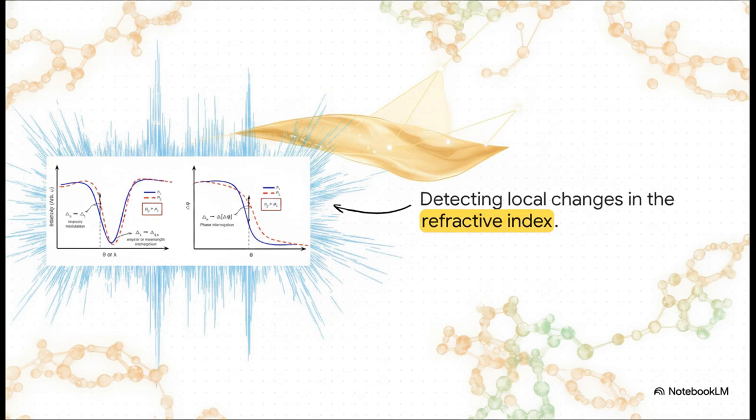So, the crucial point to take away from all of this is that these tiny, microscopic graphical shifts, these little micro adjustments in an angle of reflected light, they represent monumental biomedical breakthroughs. By simply interrogating the phase and intensity of light as it hits a gold film, we are successfully tracking and mapping the immensely complex, interconnected molecular networks that make up human biology itself.